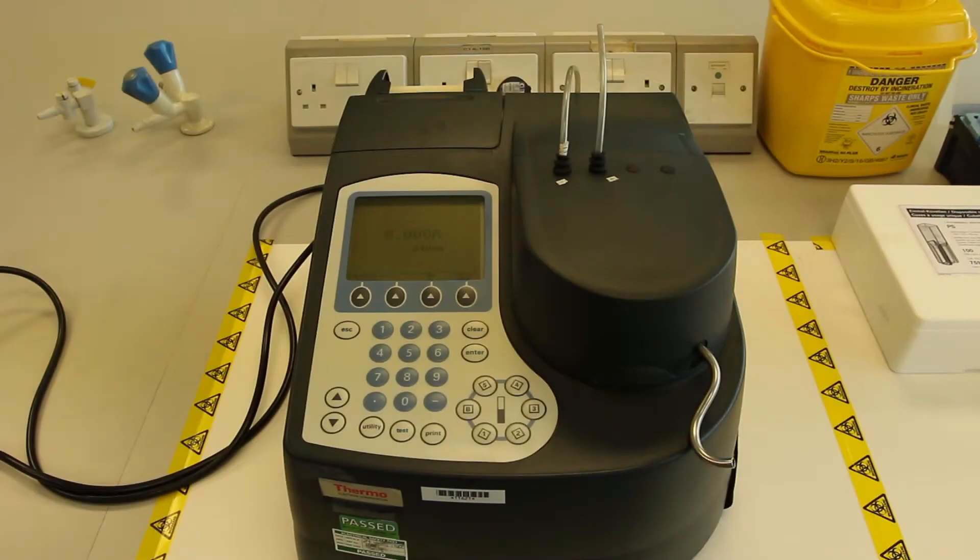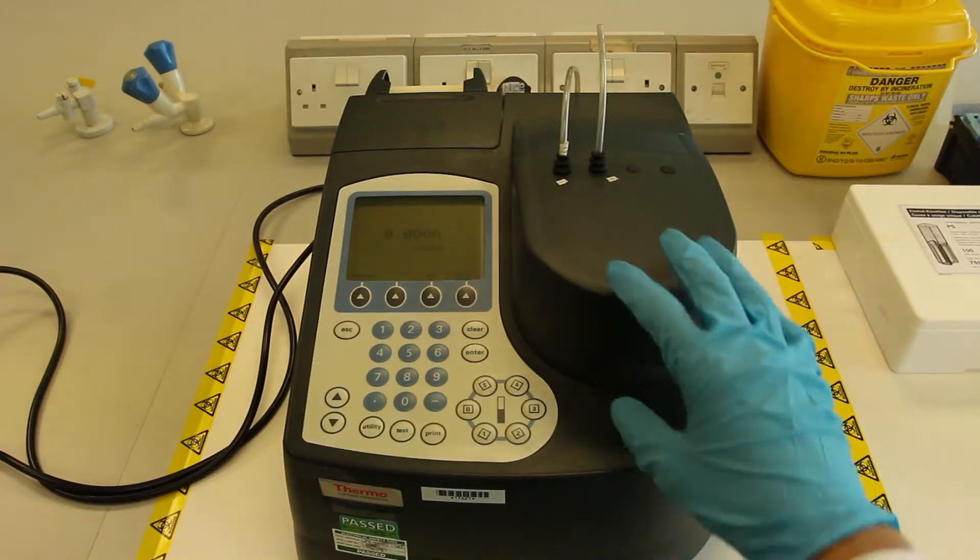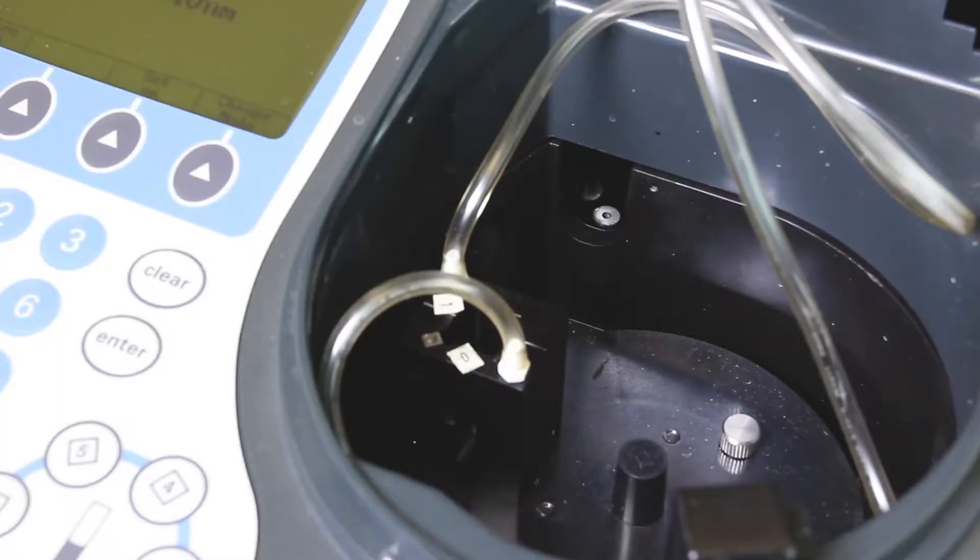There can be many components to a spectrophotometer depending on the complexity of the system you will encounter. Because many of the components are built inside the spectrophotometer, it is more convenient to name them in an illustration.